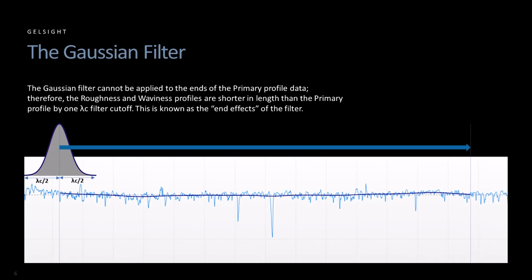The points close in distance along the x-axis to the point being processed are weighted more heavily than points further away. In fact, points further away than half the filter cutoff have weights so small that we can safely assume the weight is 0.